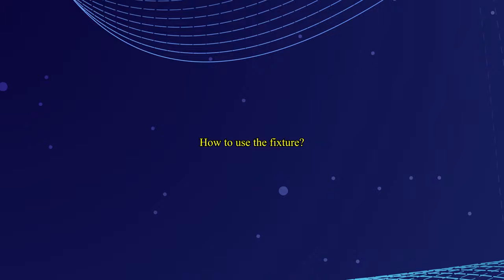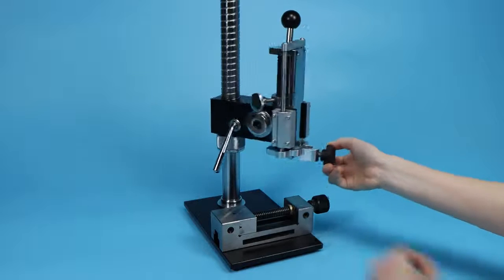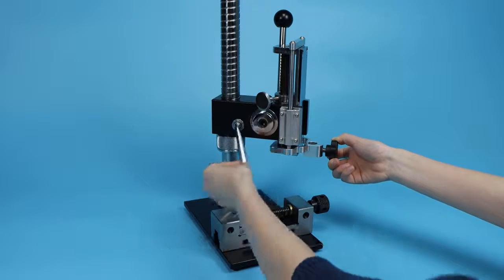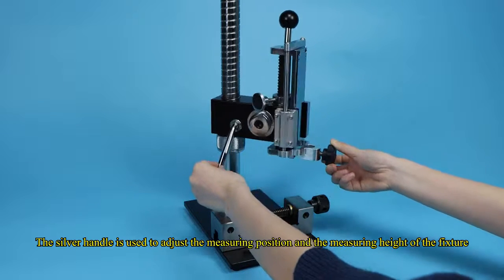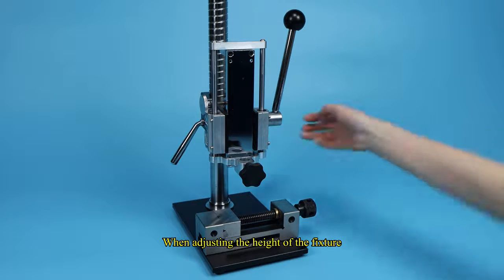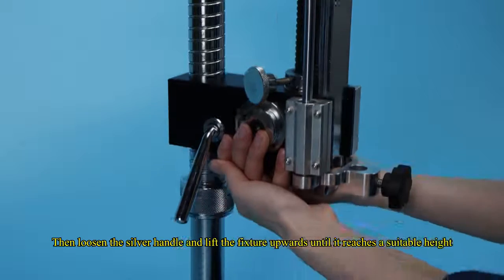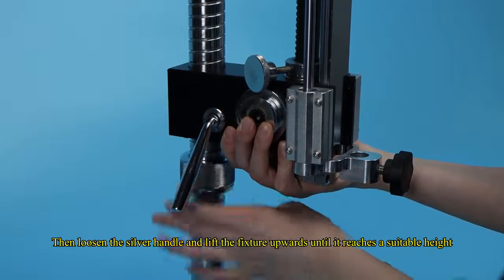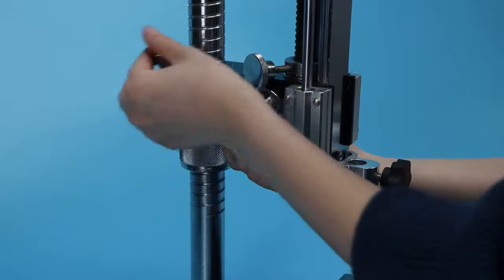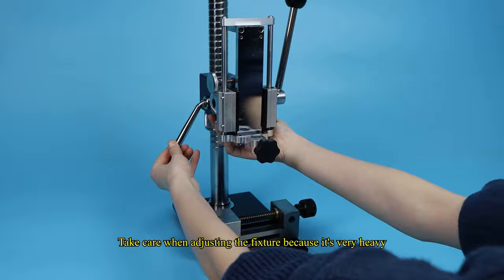How to use the fixture: this is the test grip. The round screw is used to adjust the height of the hand grip downwards. The silver handle is used to adjust the measuring position and measuring height of the fixture. When adjusting the height, hold this part of the fixture with one hand, then loosen the silver handle and lift the fixture upwards until it reaches a suitable height, then tighten the handle. Take care when adjusting the fixture because it is very heavy.